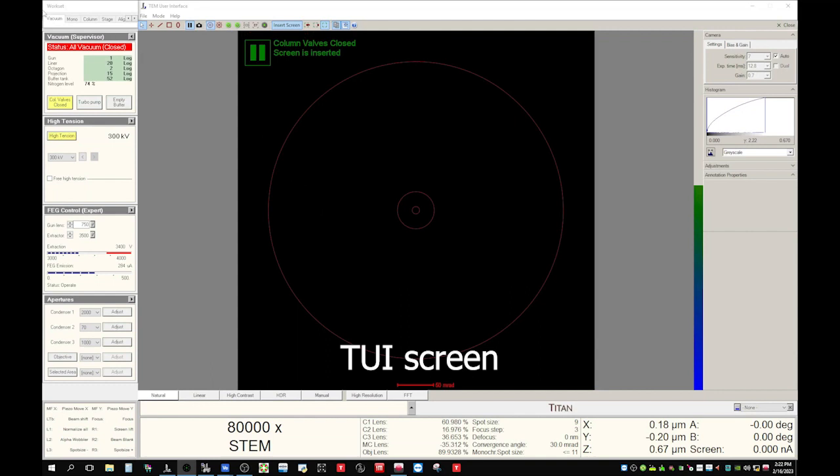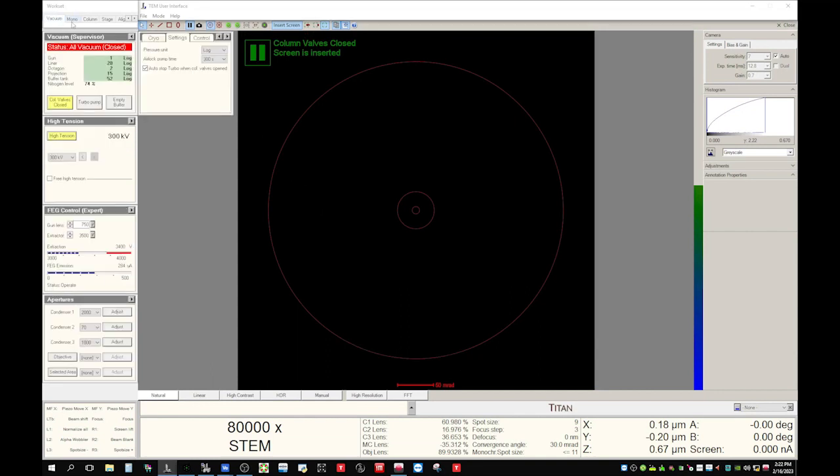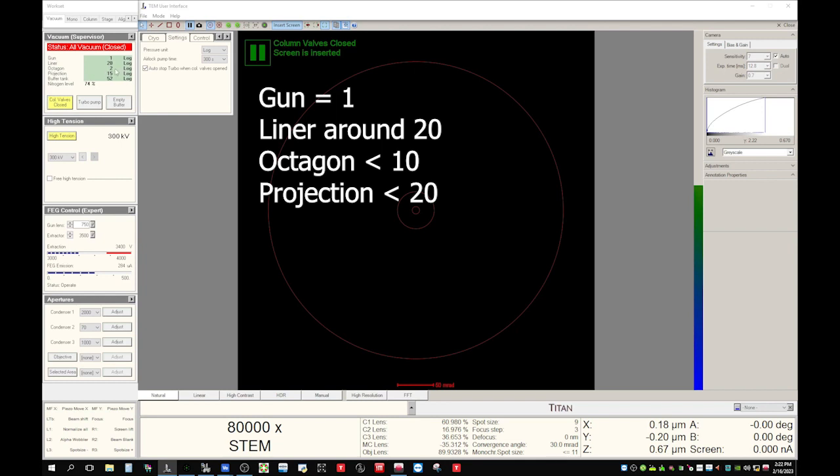First let's check the vacuum. Go to the vacuum tab in the TM user interface and check here. The gun is 1 — that's good. Liner 20 — that's okay. Octagon 2 — that's okay. We mainly want to make sure the octagon is less than 10 so that we can open the column safely. So now let's open it.